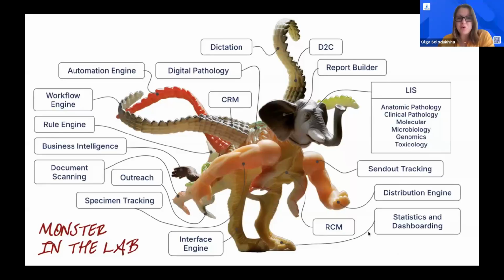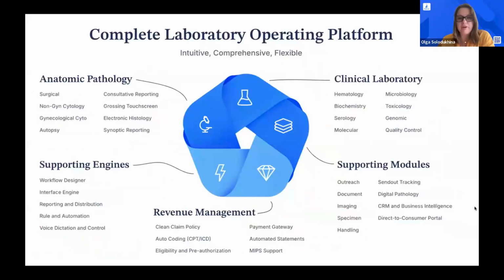So we will help you get rid of this monster by providing a solution that has a very clear structure. Even though it's really complex and in-depth, and sometimes demonstrations might take not even hours but days, especially for the bigger labs, it's still very straightforward and clear when you understand how it functions. You really can set it up the way that best fits your lab, your needs and your team.